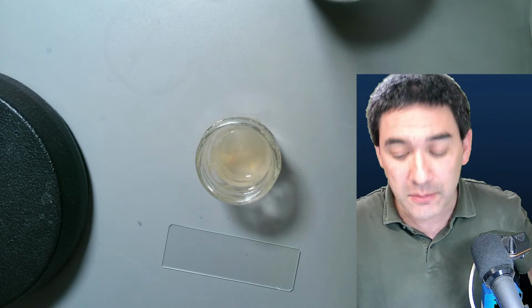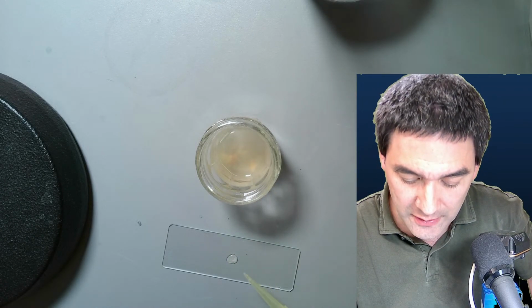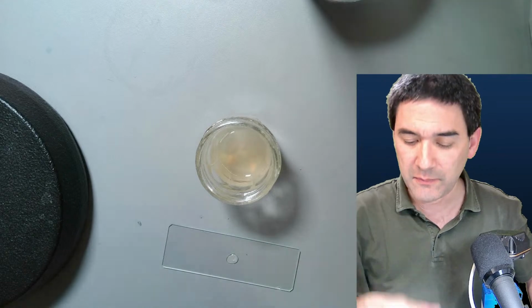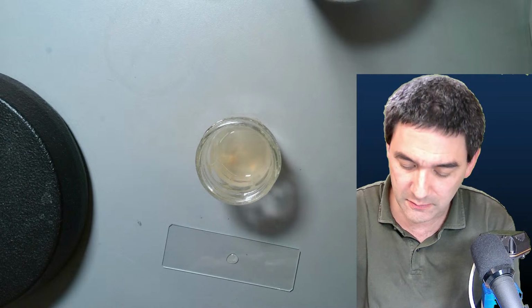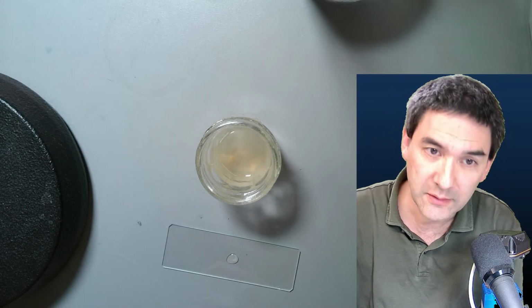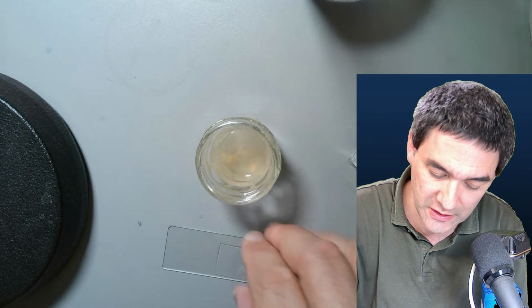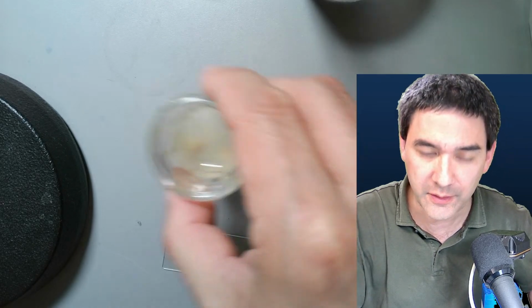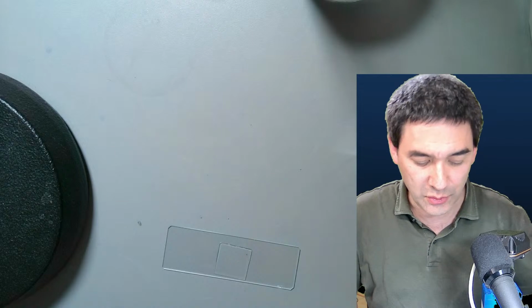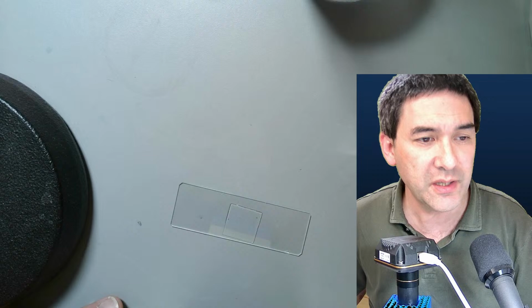They're going to be a little bit difficult to see. What we can do now is compare how this looks under the Lego microscope compared to my good microscope. I'm slowly running out of cover glasses as well. Let's simply drop it on here first and give it a try. I always remove the water sample again because I don't want it to tip over. This is probably not going to be easy, because they do not have a lot of contrast.